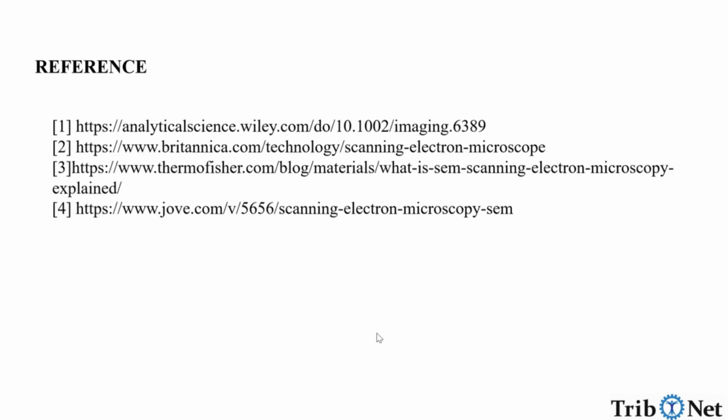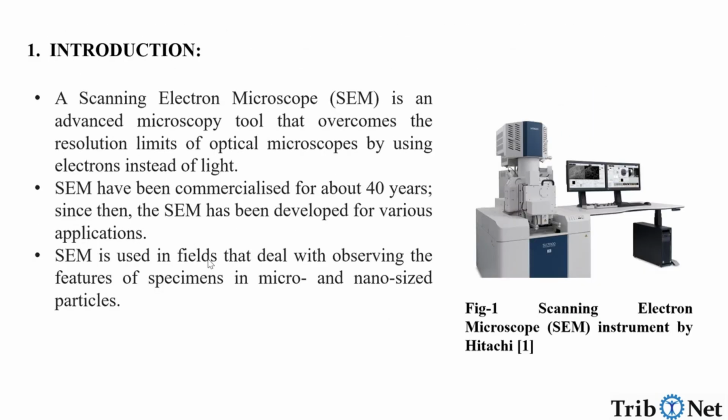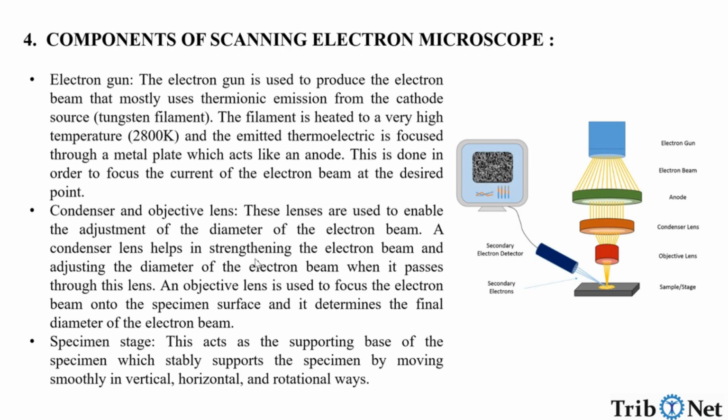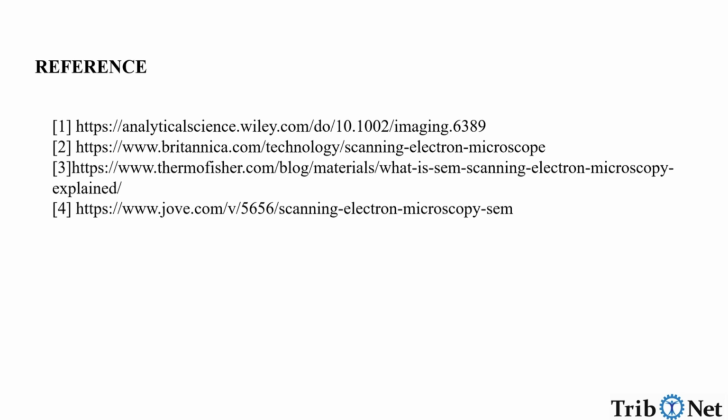These are the references for the information provided in this video. In this video, we understood the introduction to scanning electron microscope, the definition, working principle, components of SEM, and the advantages and disadvantages of SEM.